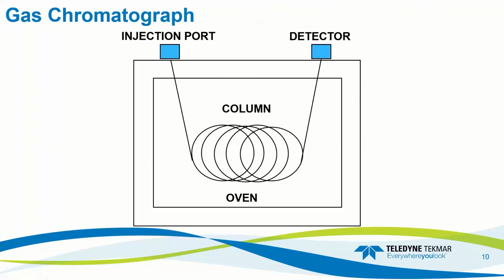Gas chromatography is one of the popular chromatography techniques to separate volatile compounds from a matrix. It is simple and it has high sensitivity in identifying and helping quantify volatile compounds. First the sample is introduced into a stream of inert gas, or the carrier gas, which is usually helium. In our case, some are trying hydrogen.